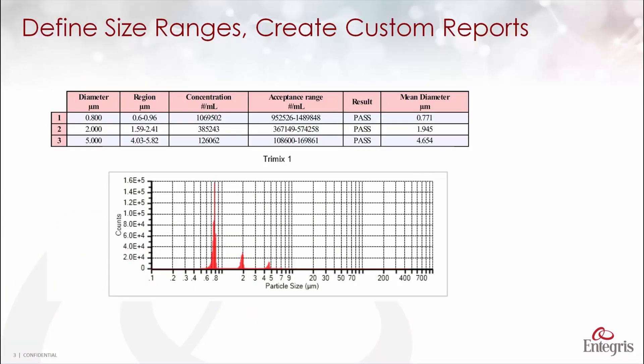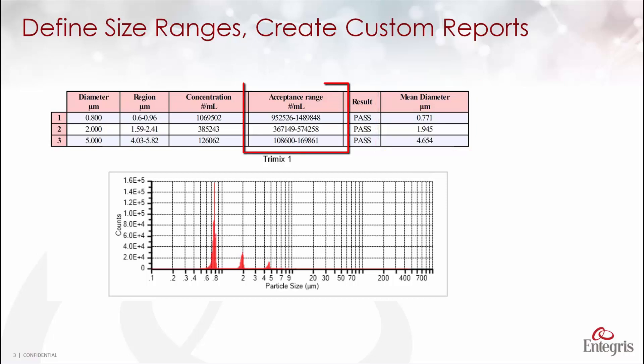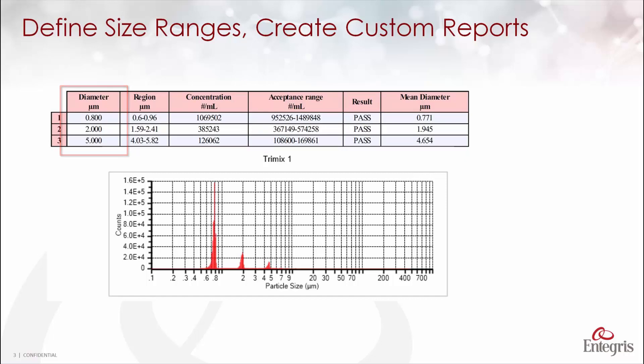We use these analyses regions to create custom reports such as the one you see here for our TriMix standard where we look at the mean size reported in this column and the concentration over three size ranges based on a nominal size of 0.8, 2, and 5 microns.